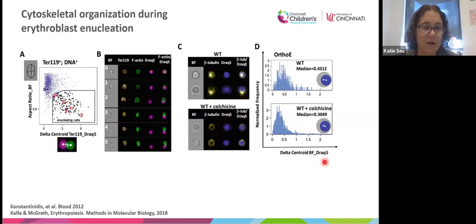So this is a rare event, very important to study though, and very challenging to isolate otherwise and maintain intact. But by being able to just fix and load the entire cell population in the imaging flow cytometer, you can preserve these events and then pull them out on the basis of their features.